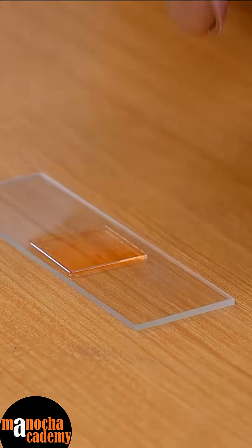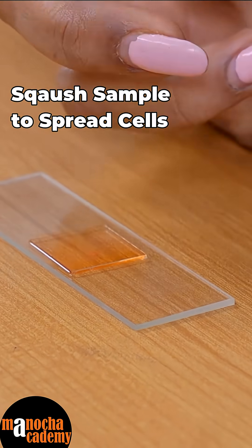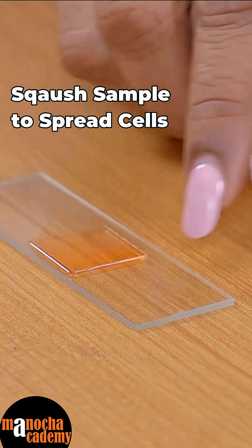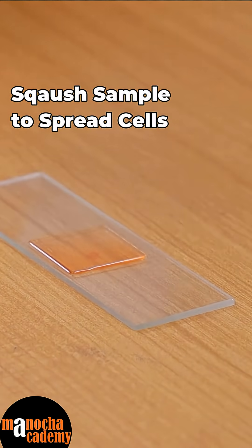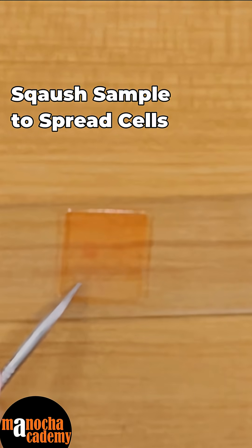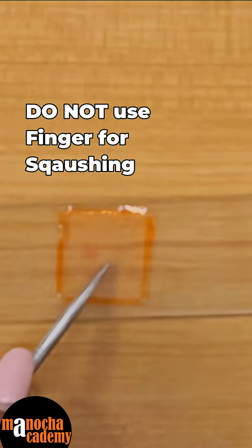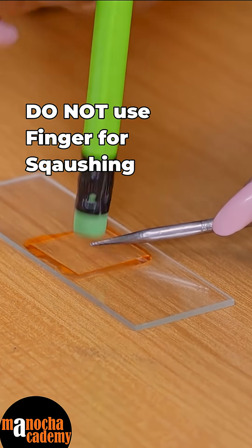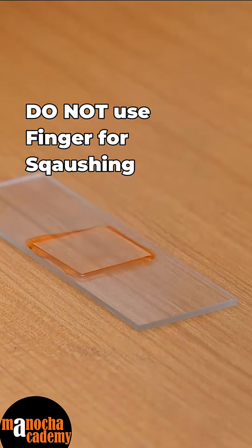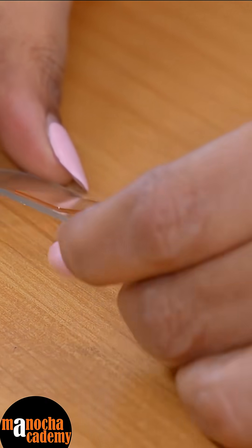However, you have to squash this root tip, because if you don't squash it, all the cells will remain in one position in a clot and you will not be able to see the cells separately. For squashing, you will be needing a rubber-headed pencil. Hold the glass slide with a needle at the center — do not use your fingers, otherwise you will leave fingerprints on the cover slip — and then slowly tap the cover slip with the rubber-headed pencil.